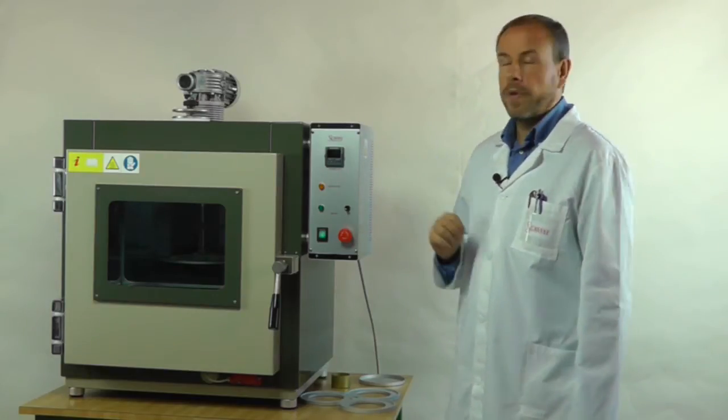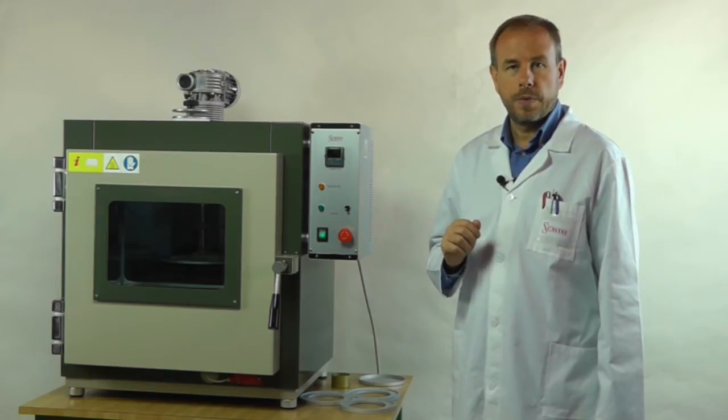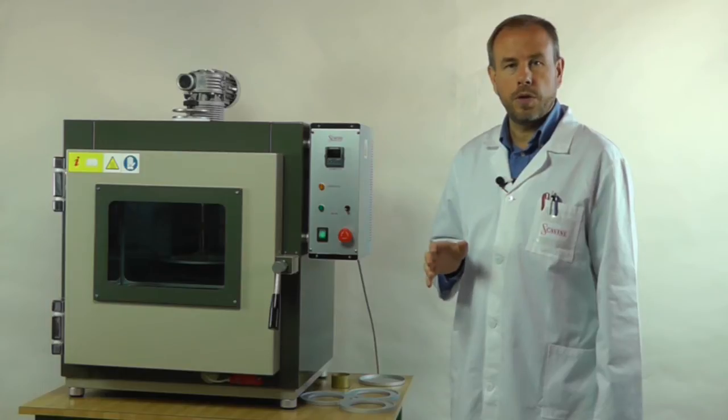On the top of the oven we see the gear reduced motor for the rotation of the shelf. The motor is electronically controlled for a precise regulation of the speed.